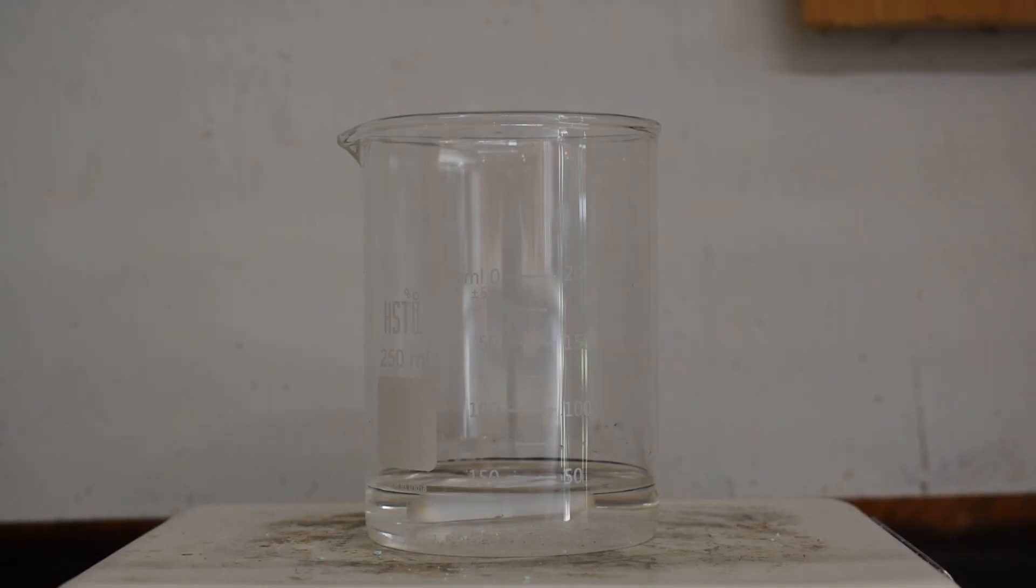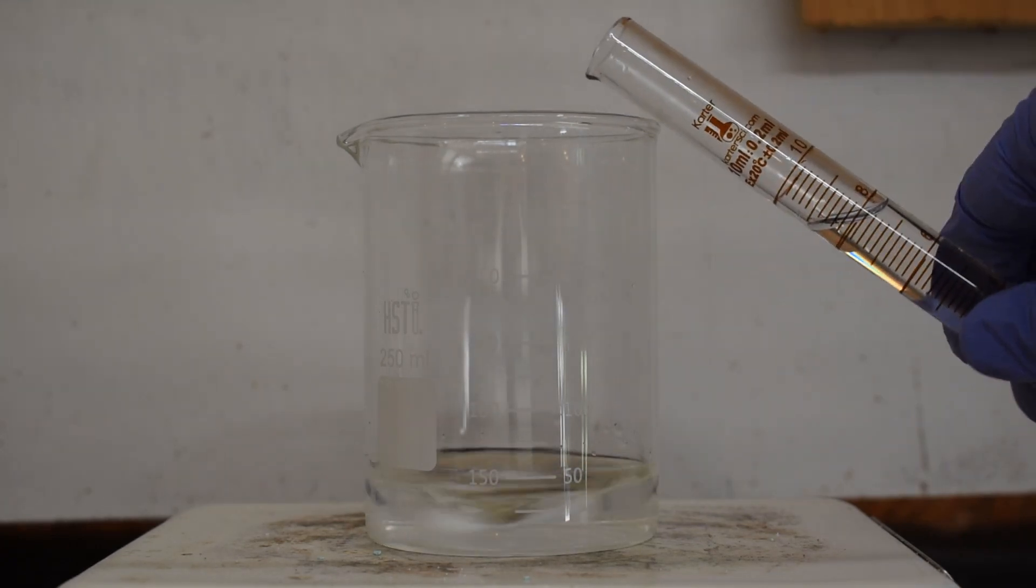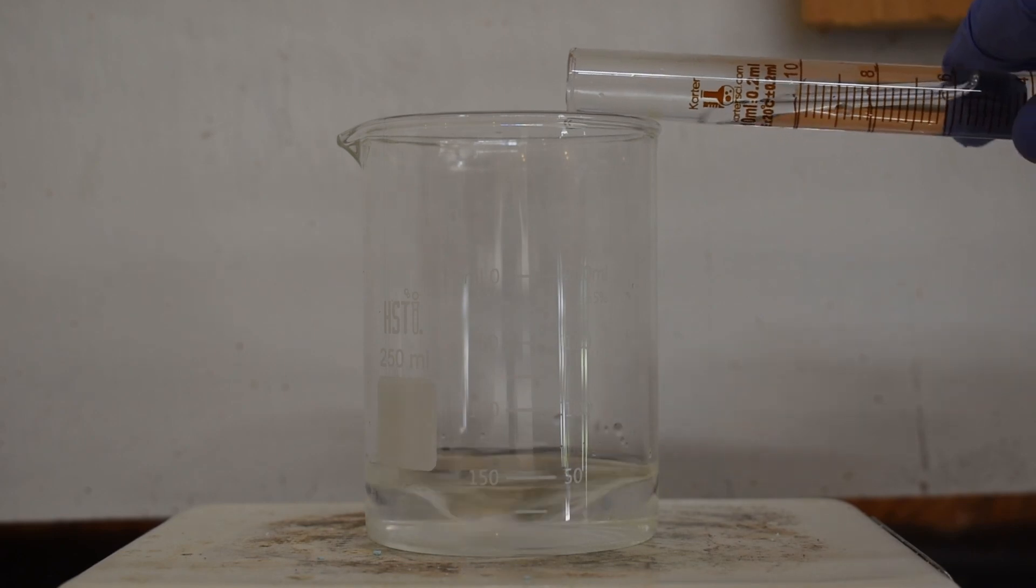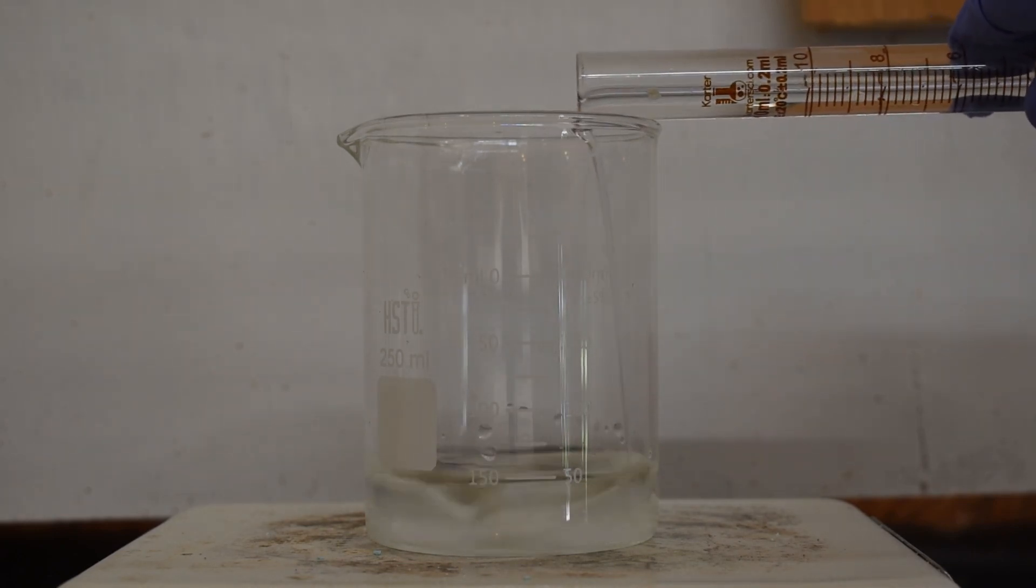I then began stirring the solution and once all of the potassium iodide was dissolved I added about 7 milliliters of 30% hydrochloric acid. This will protonate the iodide to form hydroiodic acid.